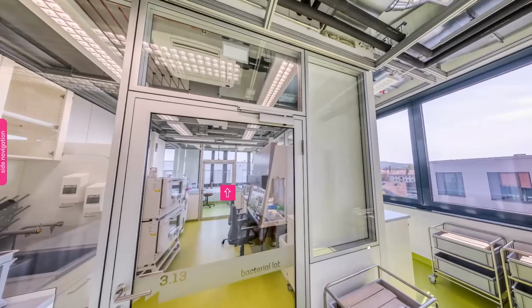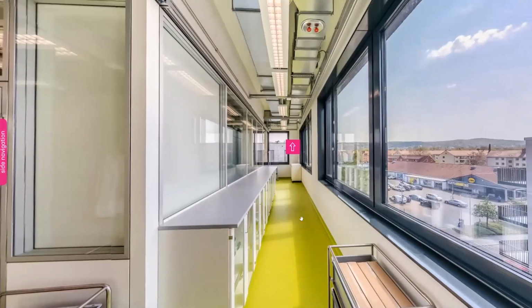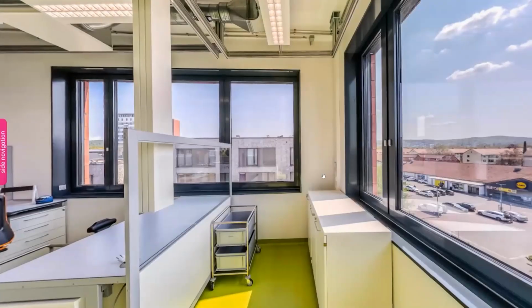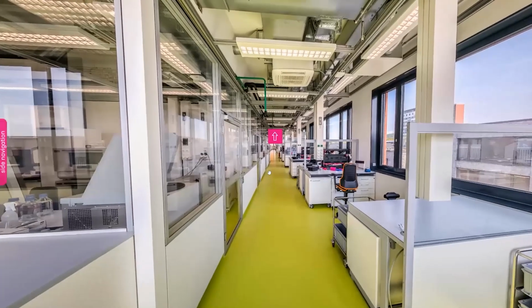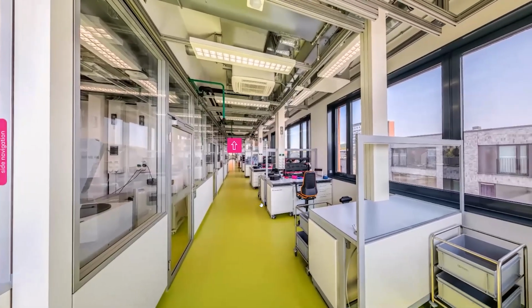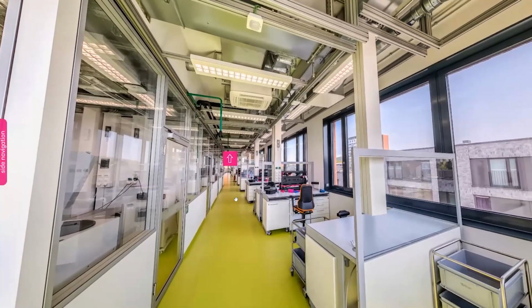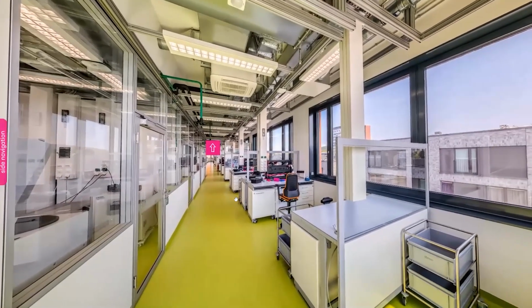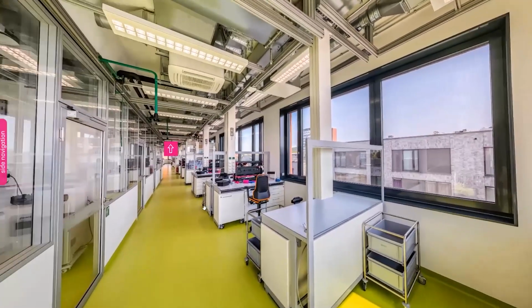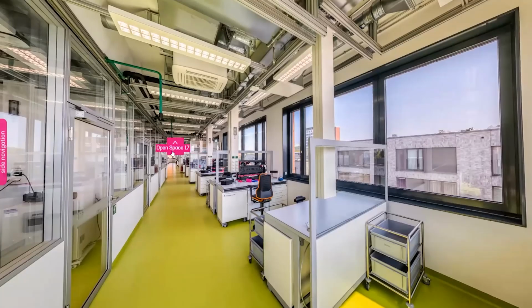Just a quick look here at the bacterial lab, same story that we had with the cell cultures. And then again, you get an idea of the openness, lightness, the loftiness of the whole place. Safety showers and everything in place. Green floor, which just gives it a bit of color, but not only the floor is green, also the energy that we have is green, the district heating and so on. So I would say it's probably one of the most sustainable ways of running a lab currently. And we see that especially now with the energy costs going up, that we have a very low energy usage for a lab of that size.